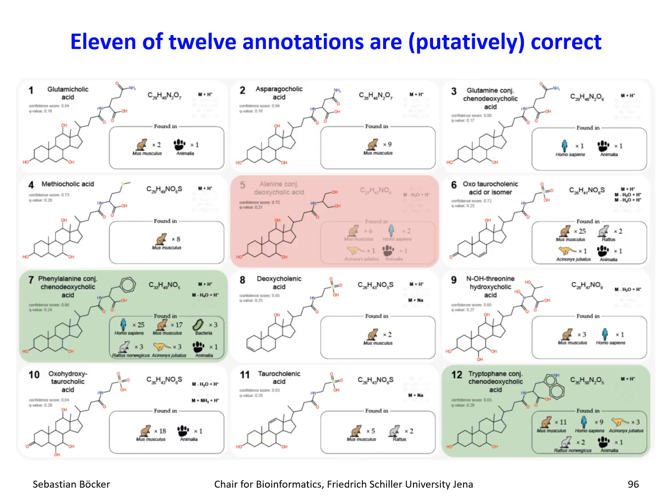What made it a little bit easier is that bile acid conjugate fragmentation is relatively well understood, so it's not that complicated. Also, we give you the putatively correct structure with this mass spectrum, and all you now have to check is whether or not our annotation through CSI FingerID is correct. And according to Louis, his manual analysis, 11 of the top 12 annotations are correct. So we annotated 11 novel bile acid conjugates.